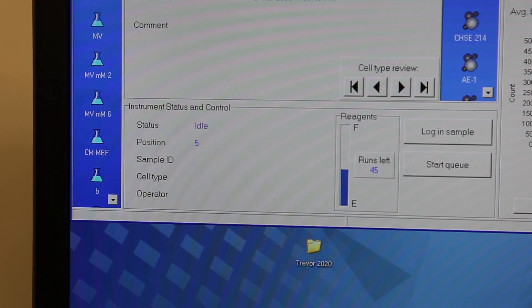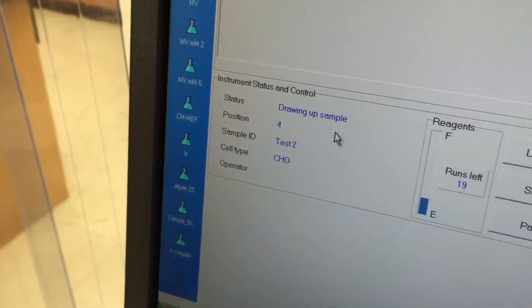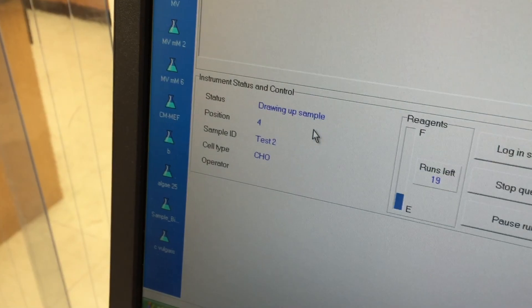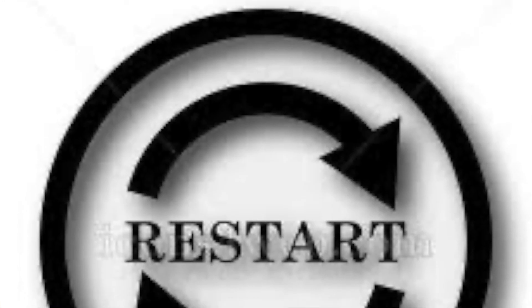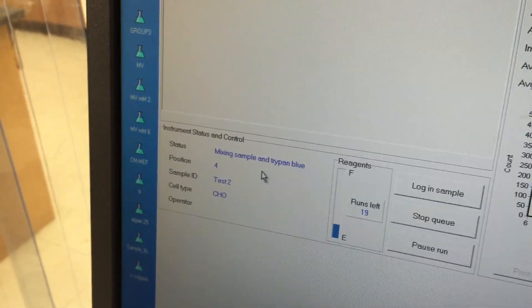In the event that the instrument status and control panel shows the status as idle, not connected, or not responding, close the VICell program, keep the VICell machine turned on, and relaunch the program.